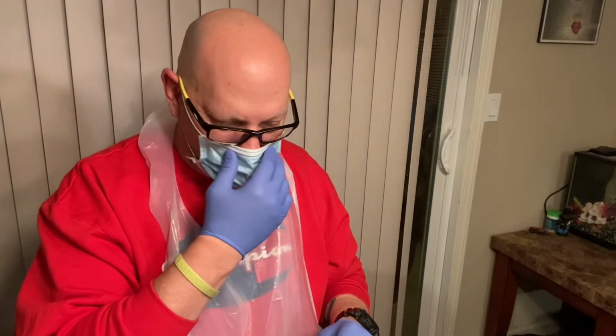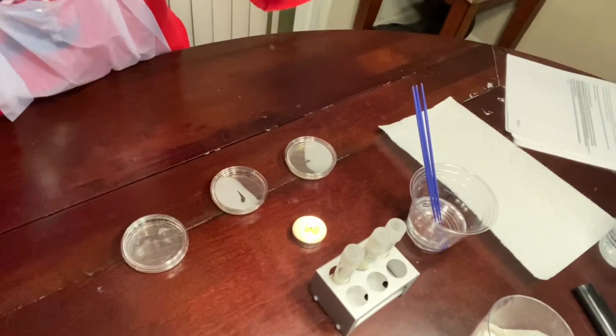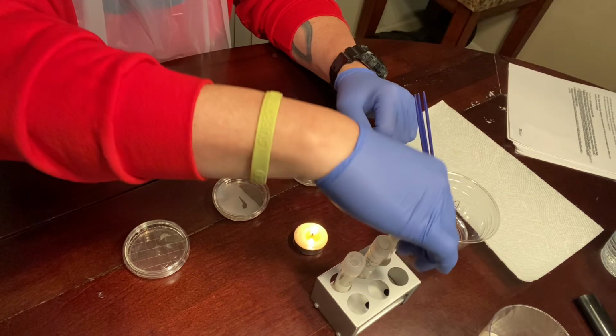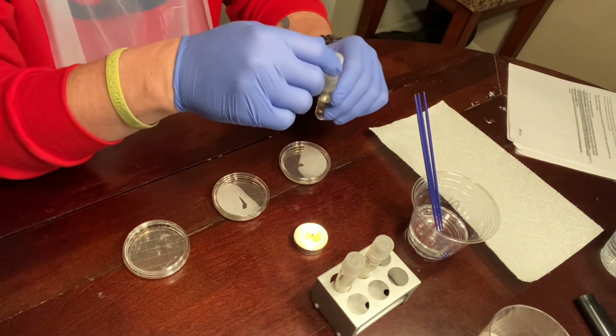And so we're just going to transfer some bacteria from the tubes to the petri dishes here. Let me adjust my camera a little bit. So this is the first one. I have the E. coli here. And I'm going to transfer to this dish.